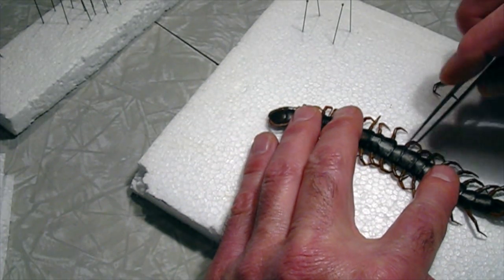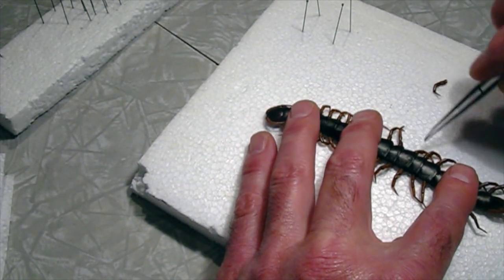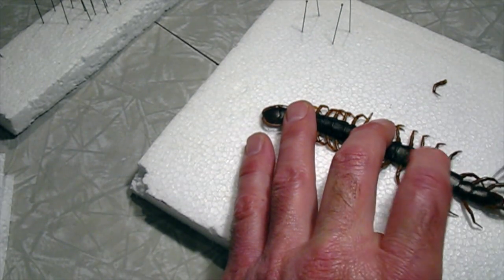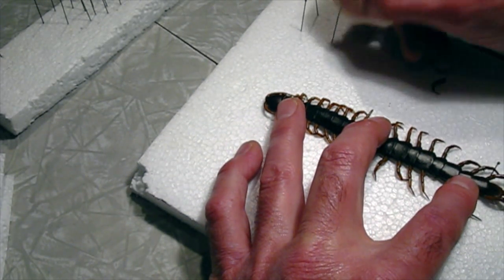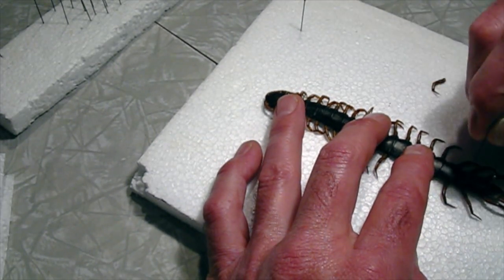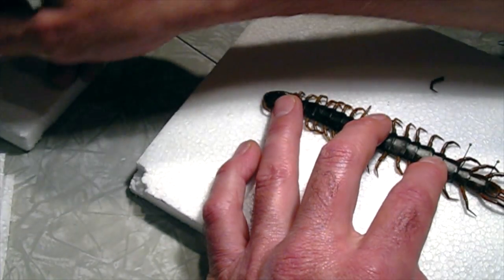Again, soaking them in alcohol like this makes them kind of stiff, so if this was fresh, it would be much easier to manipulate all of this, but then it would also not dry out nearly as well as after it's been soaked. So I'm going to use these fairly stiff pins and brace it quite a lot along the length of the body, and I can straighten out the segments as I go along too, and get them to all line up nicely.